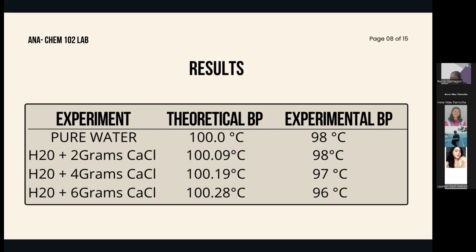Why could that be? How about the other groups? Is this also your result? Like, the theoretical boiling point and the experimental one did not match. Decreasing also for you. Okay. I hope you included that in your discussion for the conclusion.